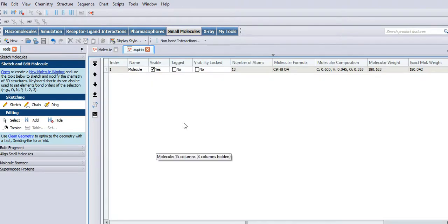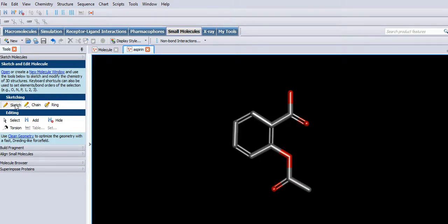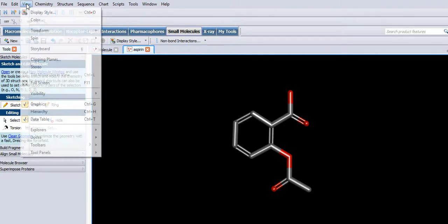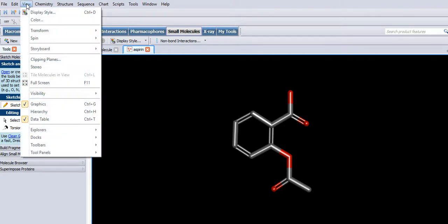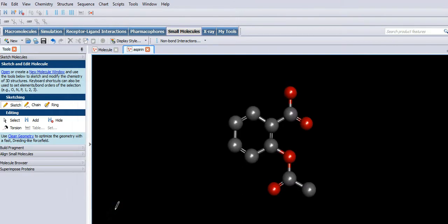So just click sketch and it will appear, there it is. I'm just going to alter the configuration there, but yeah, the display style rather. Go to scale ball and stick because I like scale ball and stick. And that looks very similar.